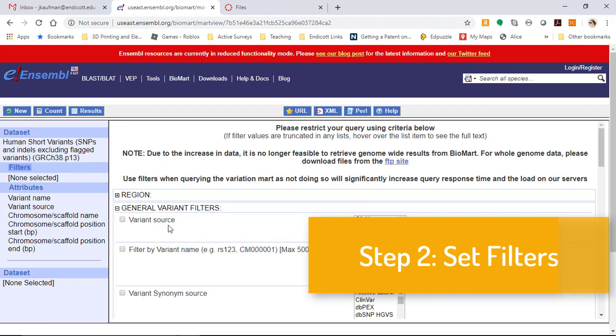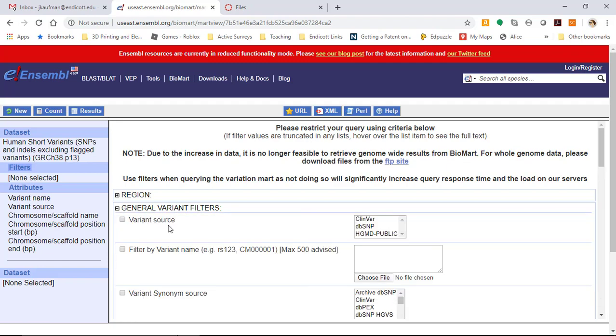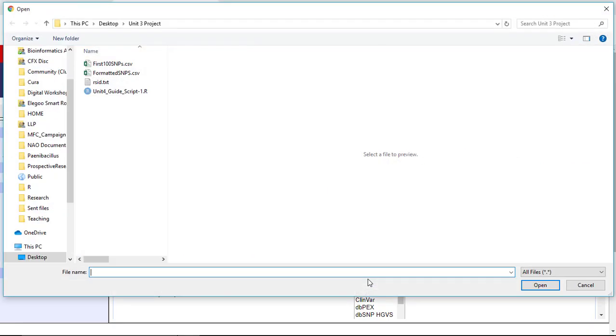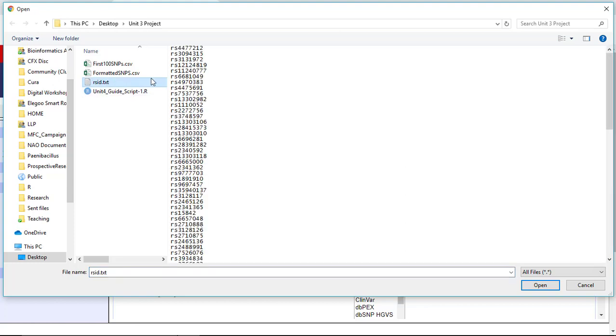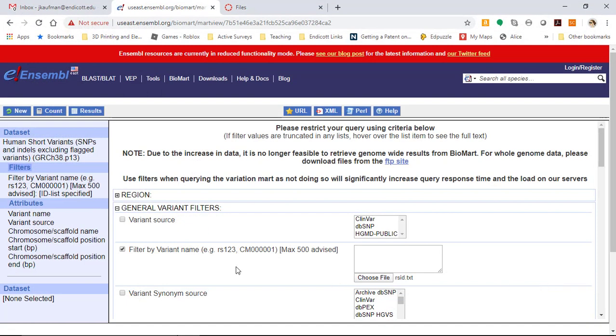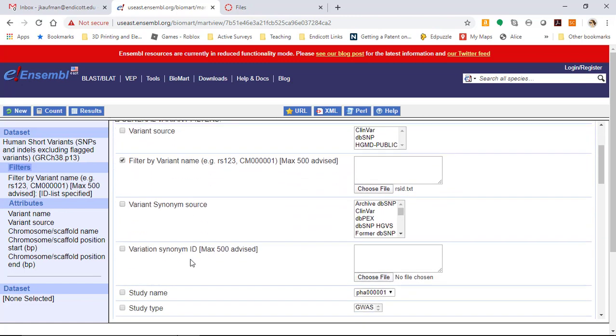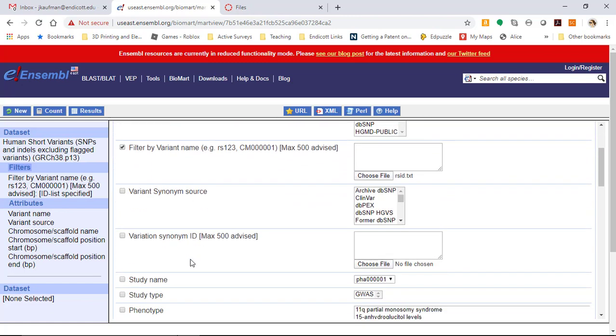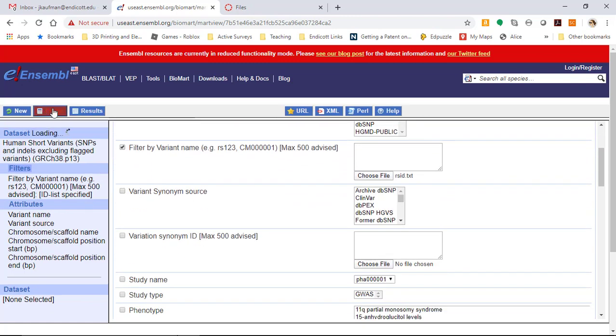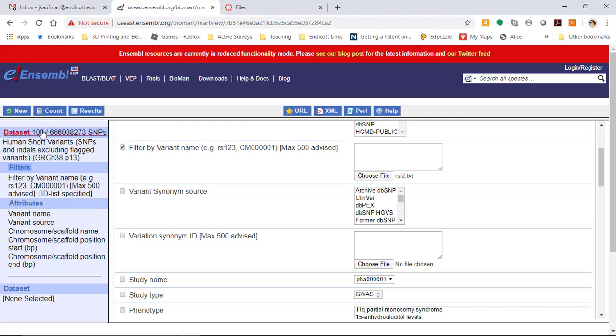The first one is filter by variant name. This is where we can use our homework results from last week as a filter. I could paste them in, but even more easily, because we were careful to format them, I can choose the file rsid.txt. Now I can run the count function to see how many things in the database match my list of 100 SNPs, and I get 100 results.